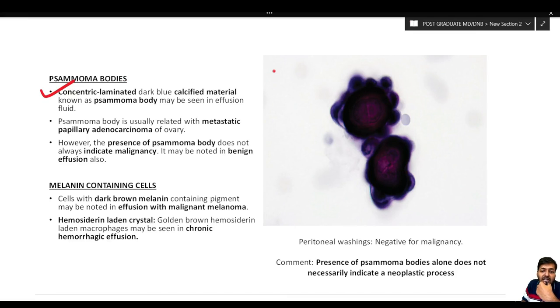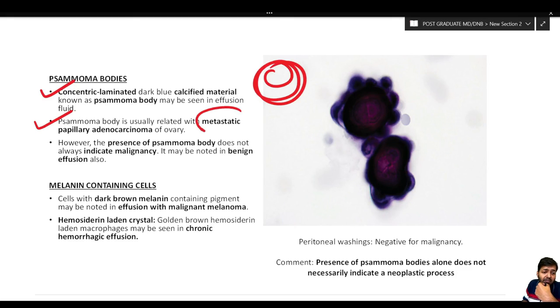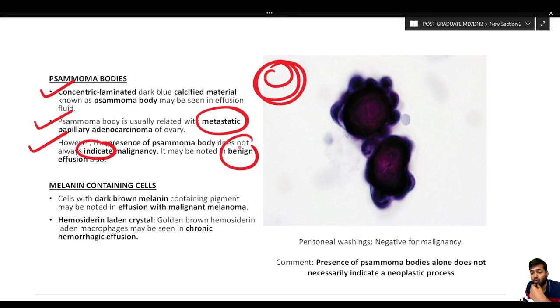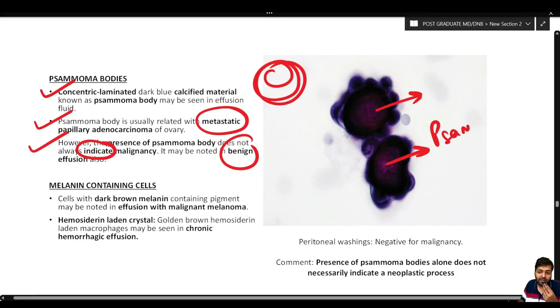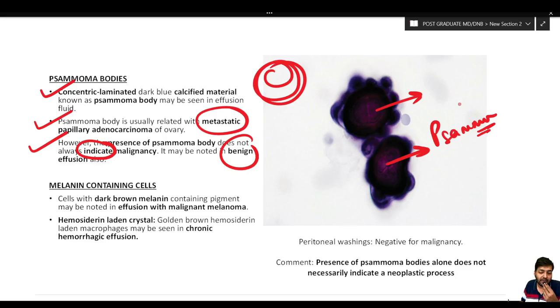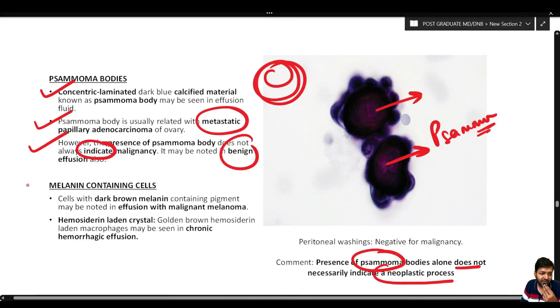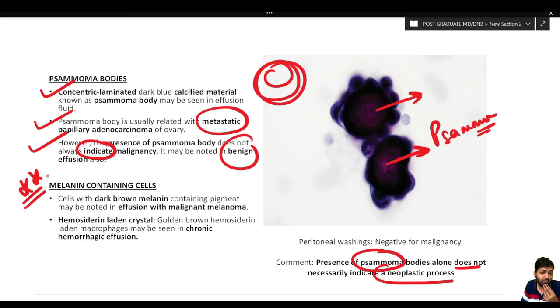Mast cells may be present in effusion fluid — mononuclear cells with blotchy purple metachromatic granules in cytoplasm on MGG stain, not recognizable on PAP stain. Psammoma bodies are a type of dystrophic calcification — concentric laminated dark blue calcified material. They are usually related to metastatic papillary adenocarcinoma of the ovary or other papillary carcinomas, but importantly, the presence of psammoma bodies does not always indicate malignancy and may be noted in benign effusion. Melanin-containing cells may be noted in malignant melanoma. Hemosiderin-laden macrophages (golden-brown hemosiderin) may be seen in chronic hemorrhagic effusion.